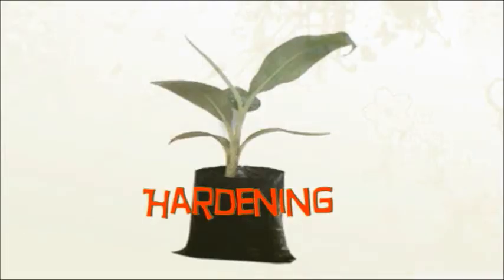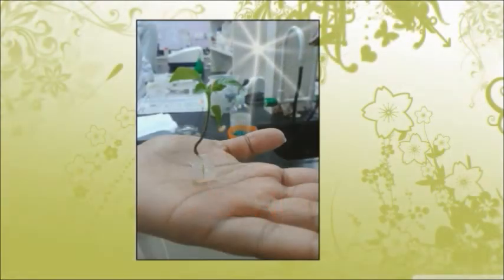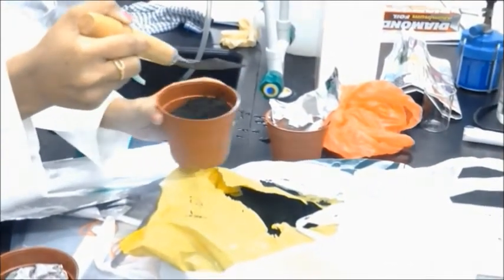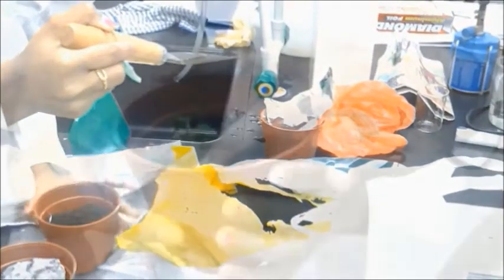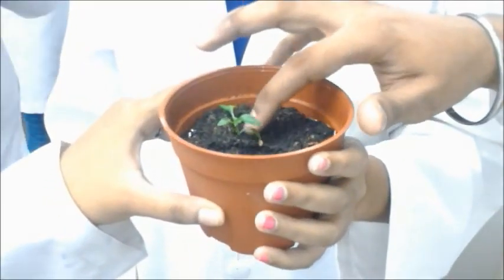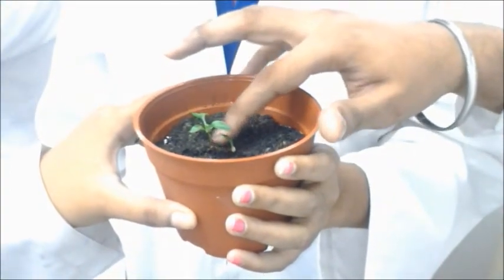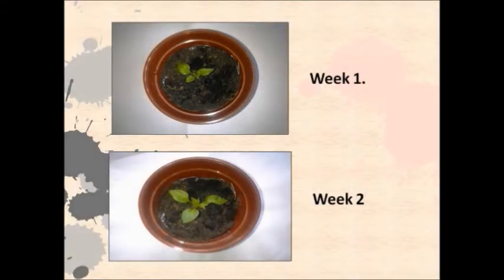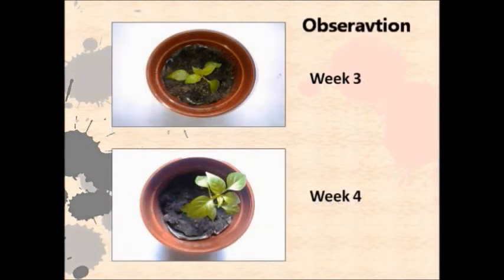The last part of micropropagation is the establishment of plants in soil, also known as hardening. A three-month-old plantlet is carefully removed from the bottle, then cleaned and washed with tap water to ensure all attached media is removed. After that, the plantlet is transferred to a flower pot containing soil. A clear plastic bag is prepared mainly to improve air circulation and maintain 100% humidity for the plant.